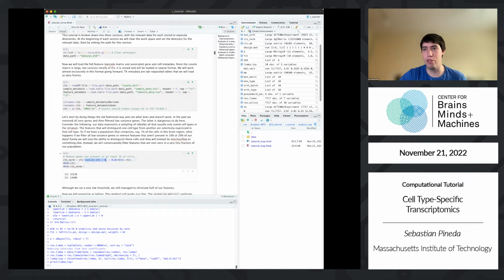So what I'm doing is I'm removing genes that were not detected at all. They have 0 counts across the board. And because I also only want to deal with genes that are sufficiently abundant, because those are the only ones that can be analyzed, I'm going to remove everything that isn't present in at least 1% of cells. Why 1%? Because you have very rare cell types. In this brain region, for example, we have T cells. They make up less than 1%. And they're important. We don't want to remove all the important genes that are responsible for T cell identity, because then we won't be able to identify those cells. So once we do that, we filter out about half our genes. Notice we filter out a lot more than we did in trap.